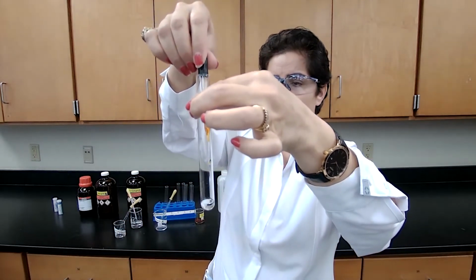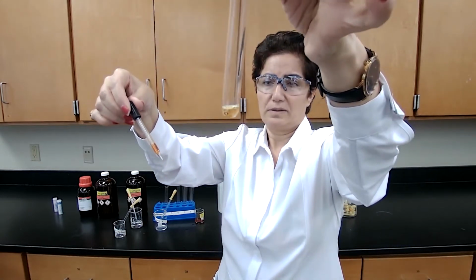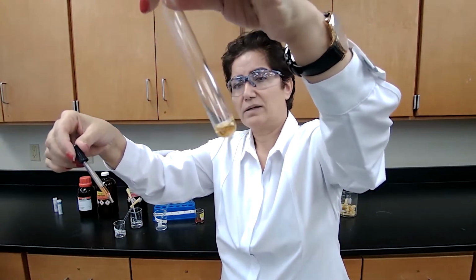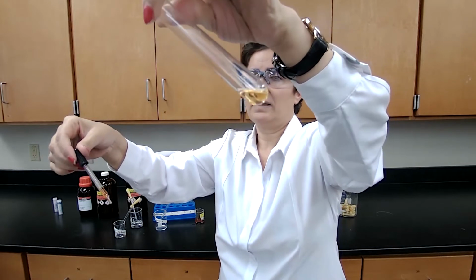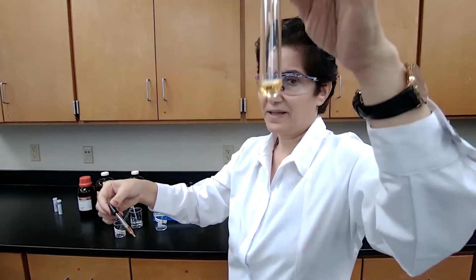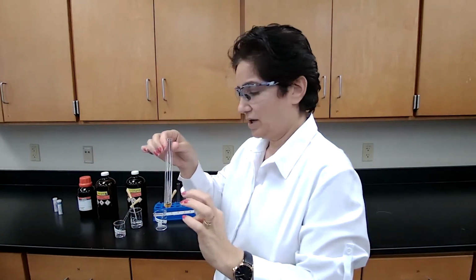I would add a drop of the bromine water and look for the color. Record the color. It disappeared or it did not disappear. Based on that, you would conclude if it has the carbon-carbon double bond or not. This is for unknown A.